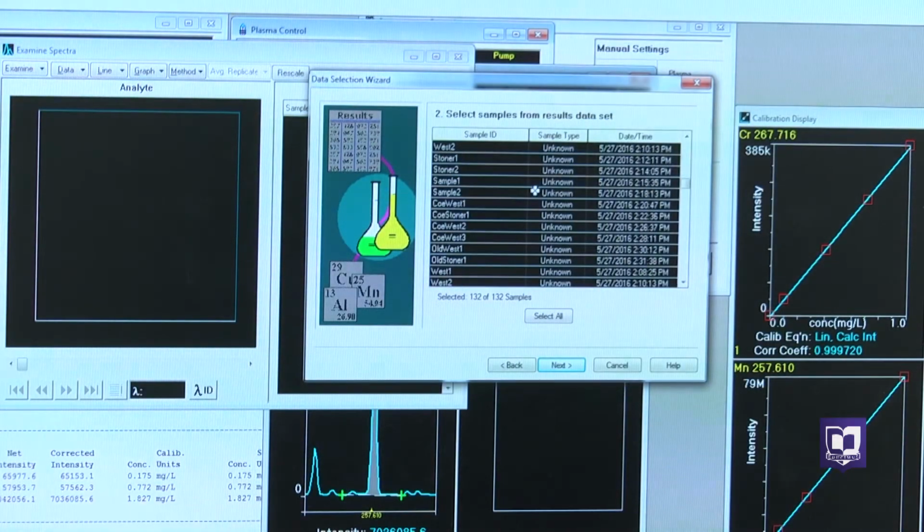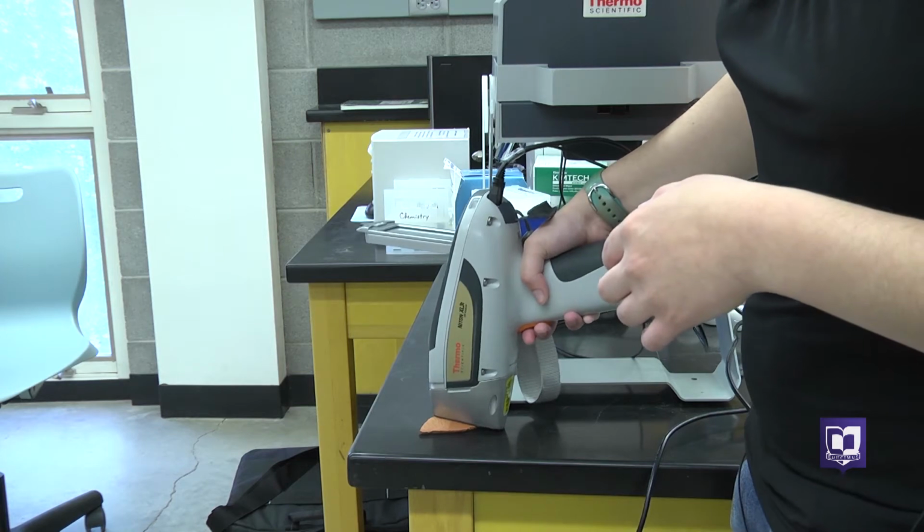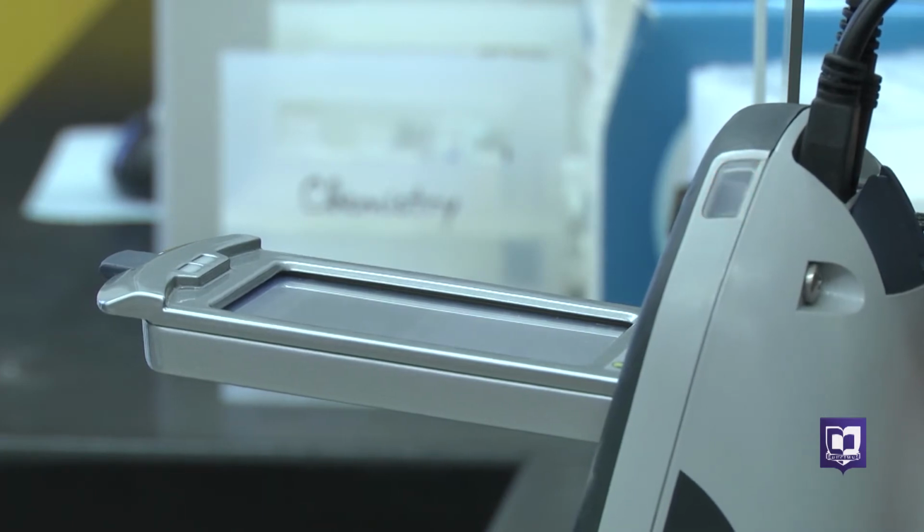While the two projects are different, they both involve using the same instrument to gather data, an XRF. We're using an X-ray fluorescence spectrometer to look at both kinds of samples, and it is our only portable instrument, so we can take it out in the field and look at soil or stream sediments, and we can take it down to Iowa City and look at the pottery samples. And in both cases we're interested in the trace element composition.